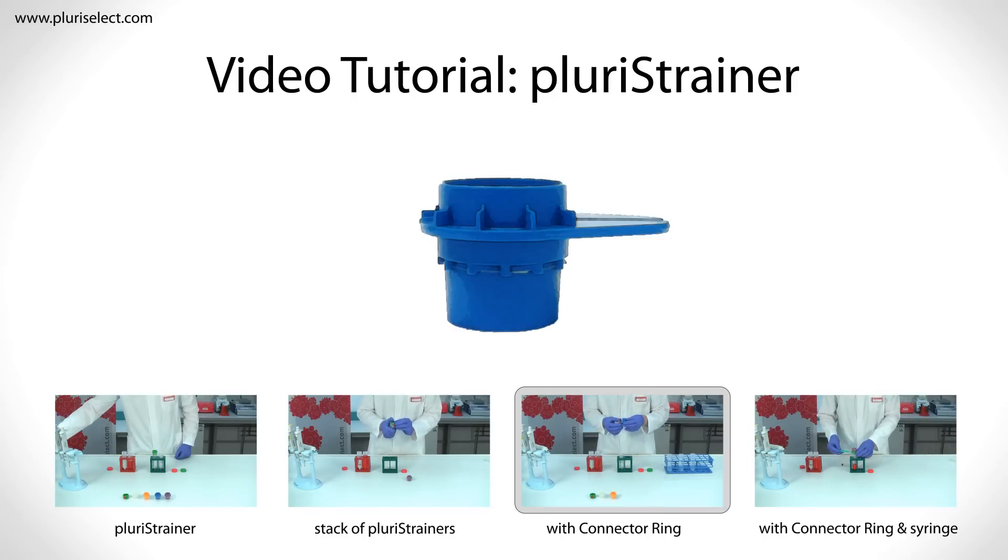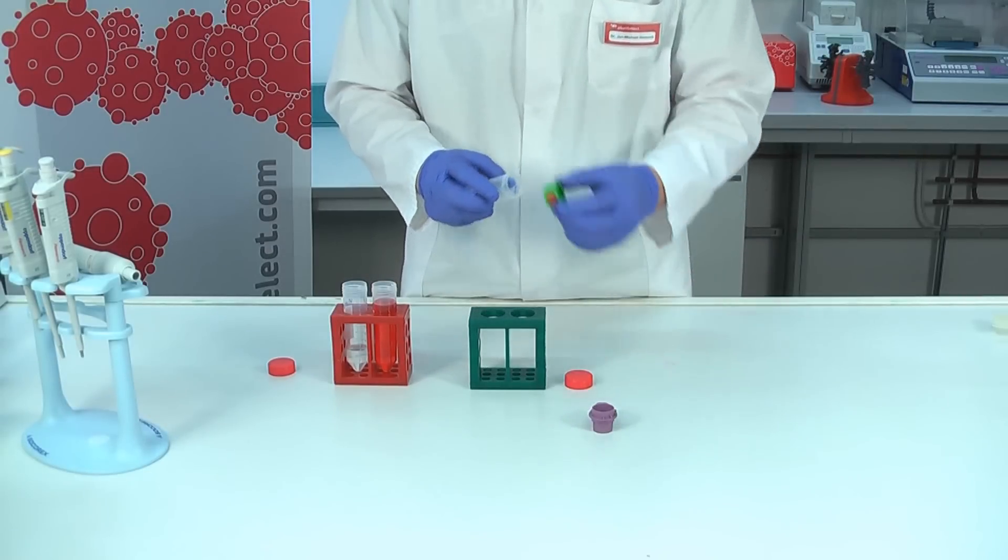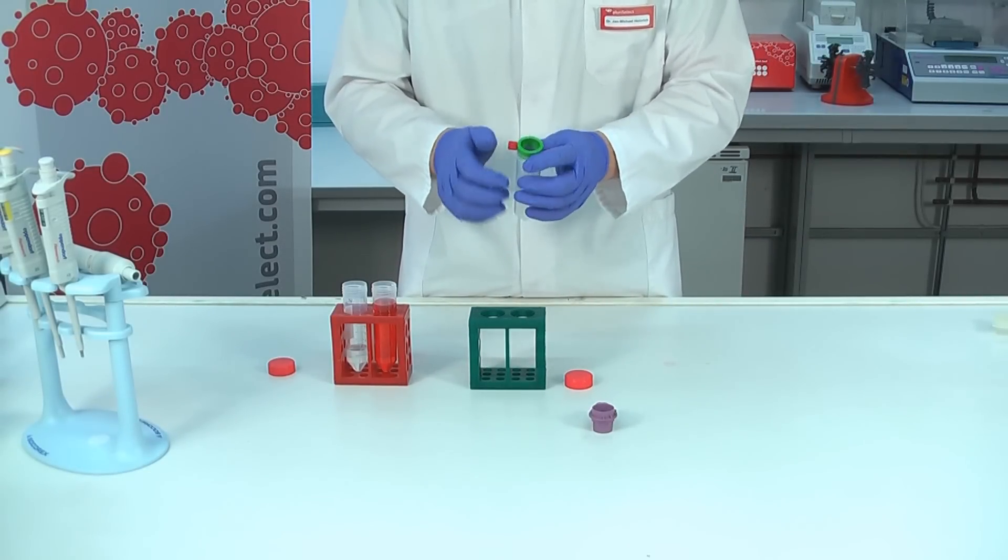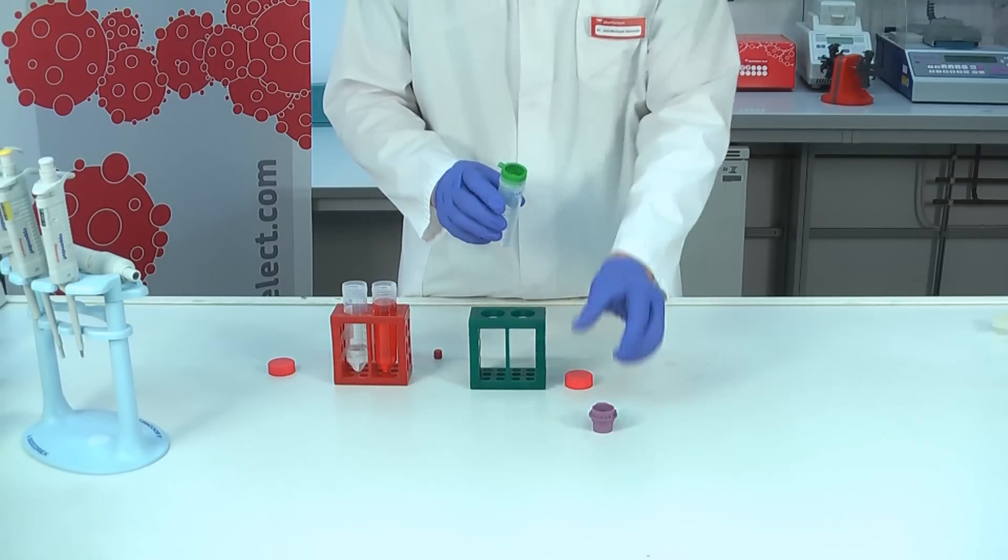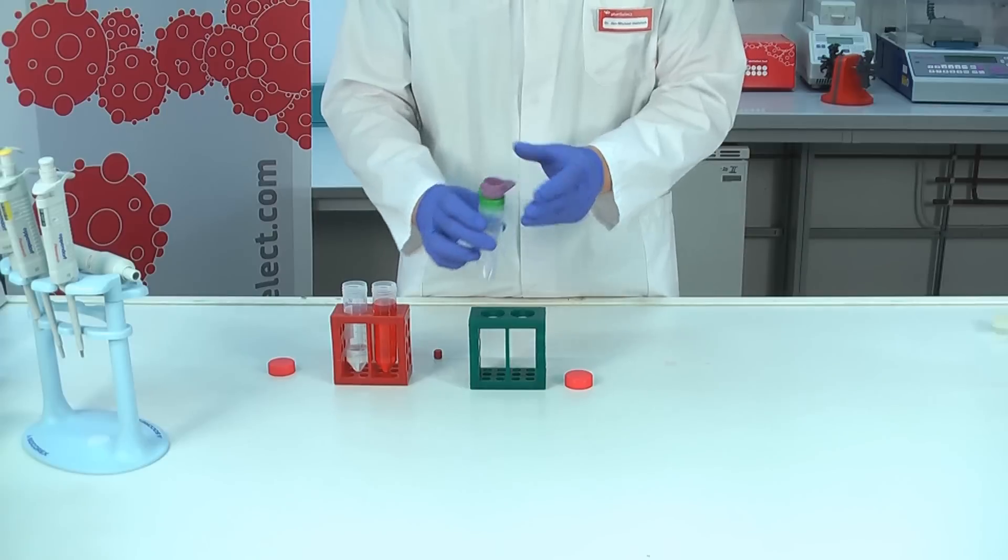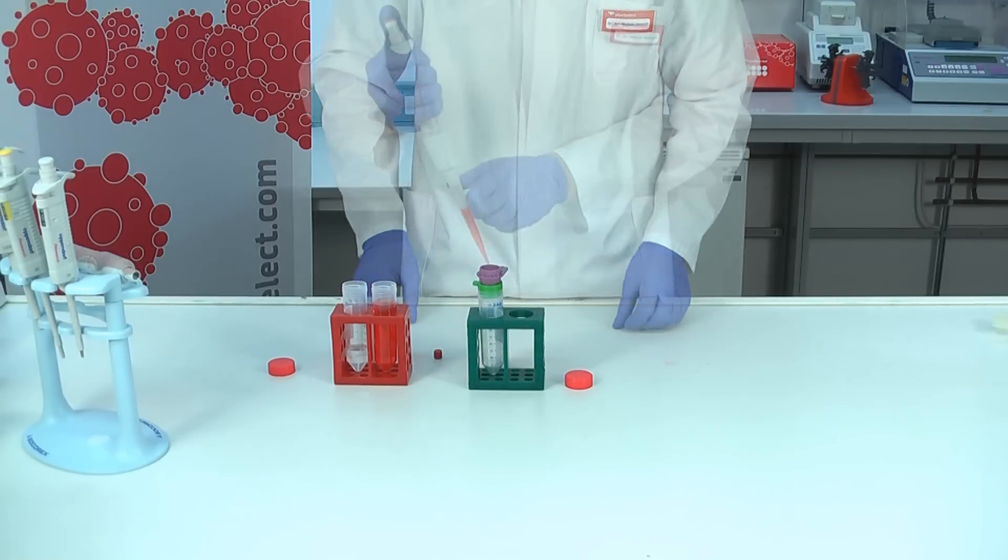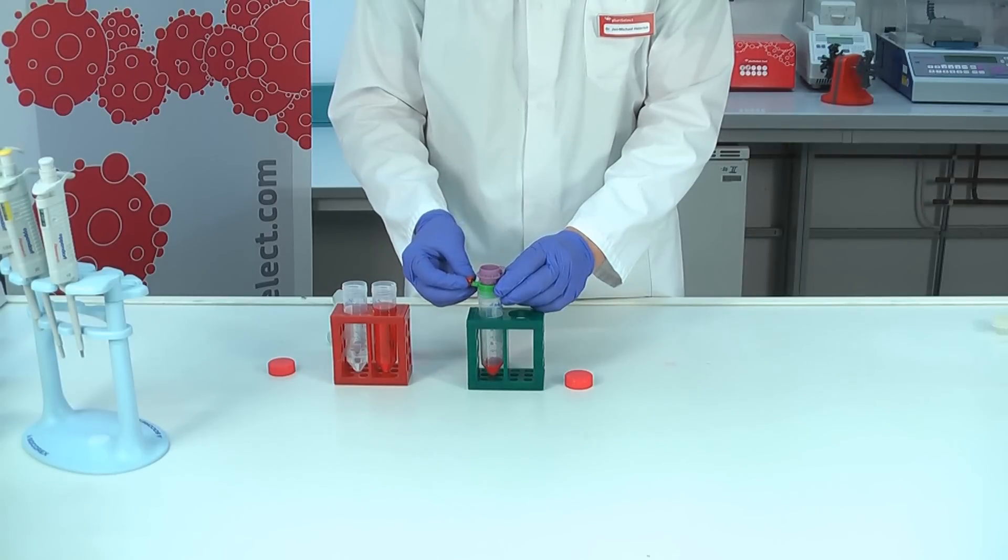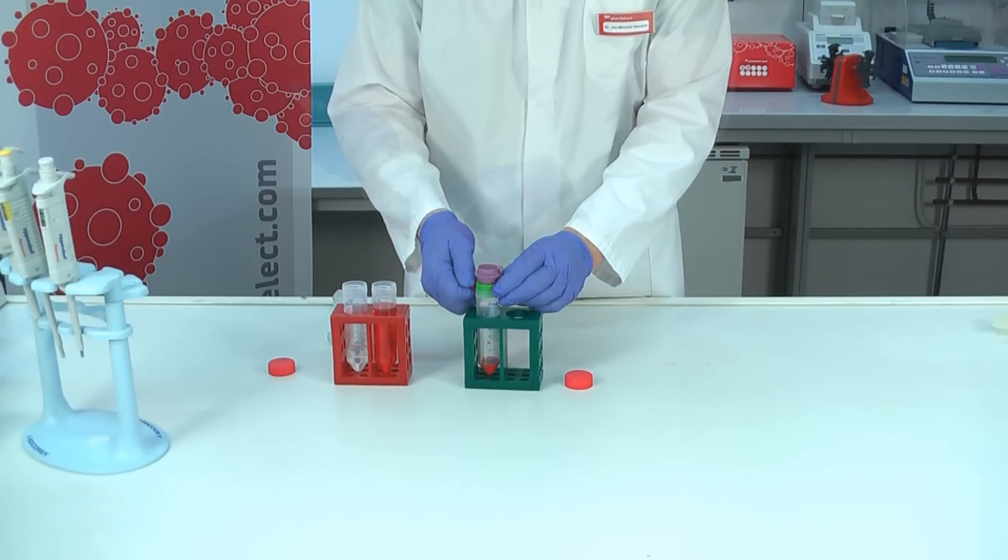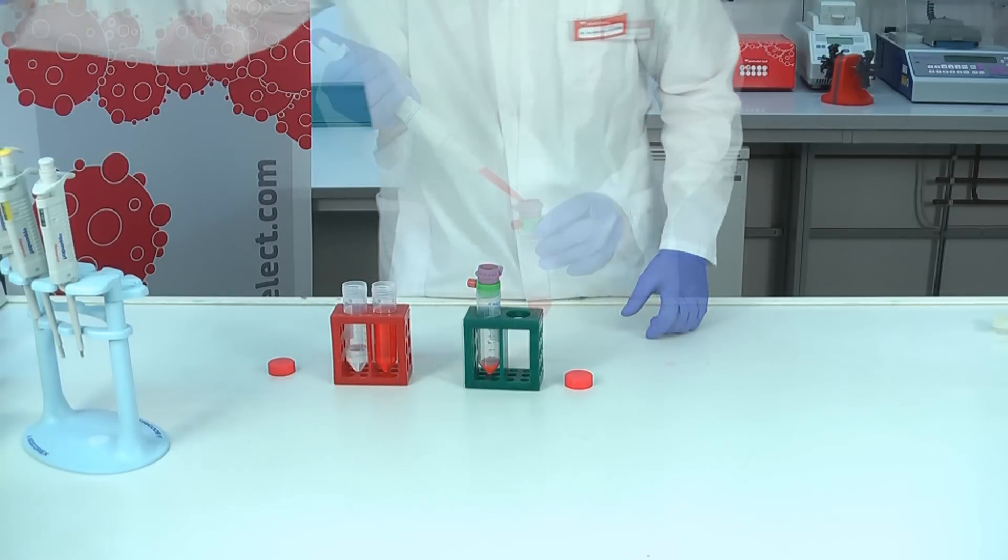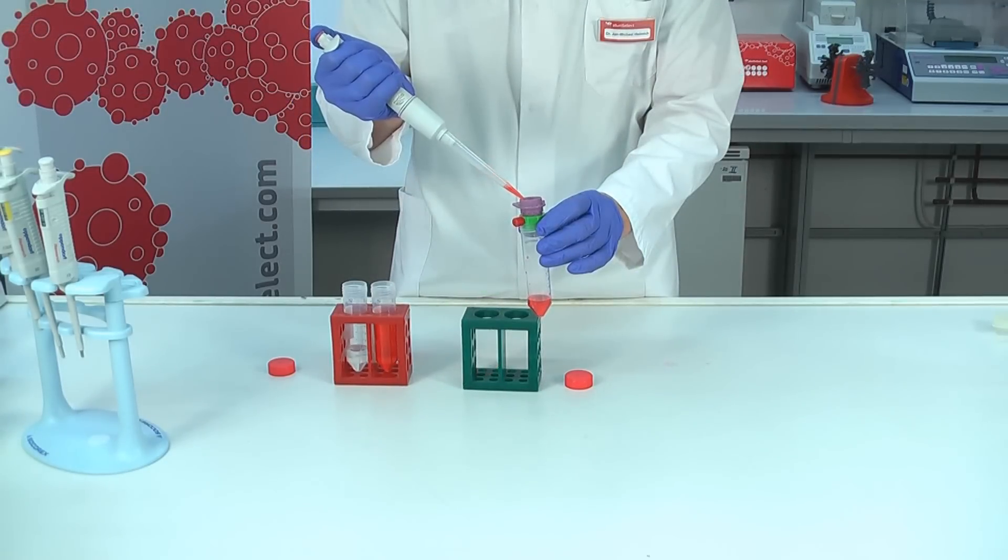Another special feature of pluriStrainer is that you can combine it with a connector ring to control the rate of flow. First put the connector ring on a 50ml tube and make sure it fits tightly. Then add the pluriStrainer on top. When the Luer lock is open, your sample material will run through as shown before. Now close the Luer lock and your sample material will stay on the strainer. This way you can work on it, for example to lyse cells directly on the strainer.